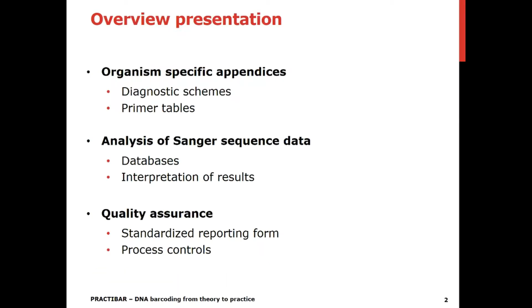In this presentation, we'll visit the EPPO website and look at the DNA barcoding standard for selected EU-regulated organisms. We'll touch upon the organism-specific appendices, the analysis section, and on quality assurance considerations that have been implemented in the standard.